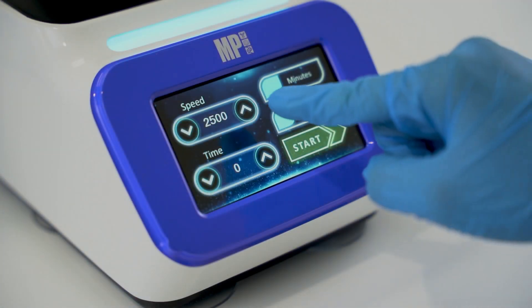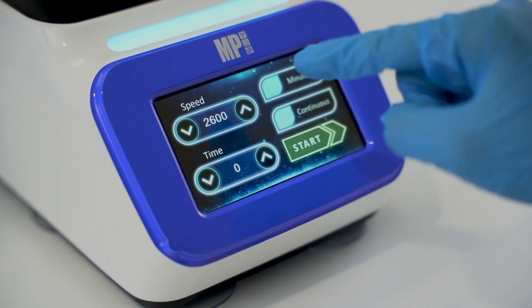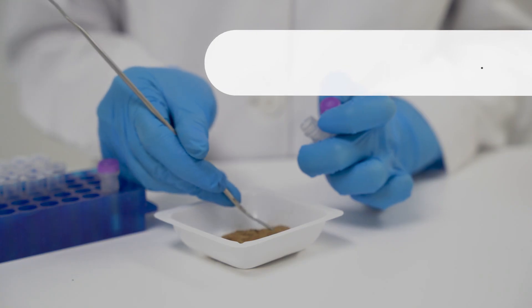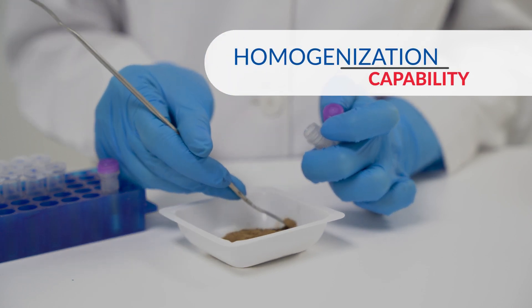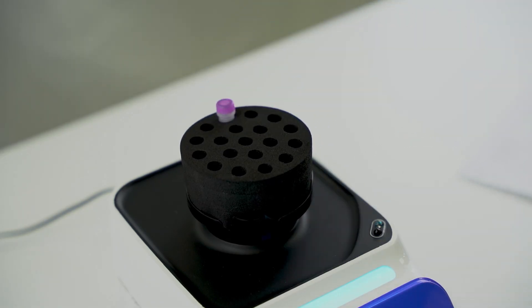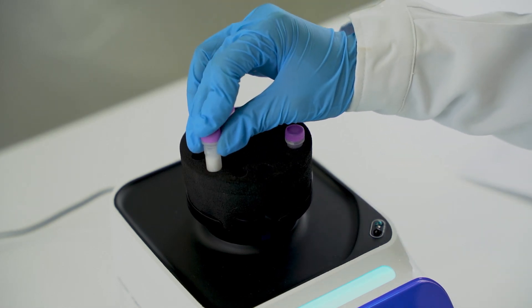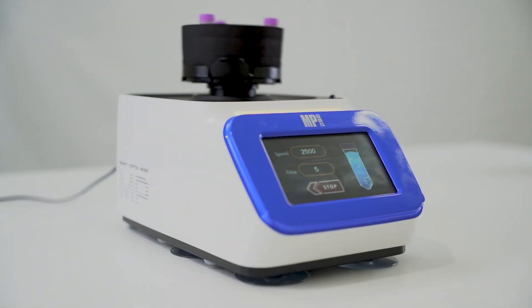Its user-friendly interface allows for intuitive control, making it simple to adjust speed and duration with just one touch. Equipped with advanced homogenization capabilities, it not only agitates samples with precision, but also ensures consistent and efficient homogenization, seamlessly combining both vortexing and homogenizing functions to enhance your lab's productivity and efficiency.